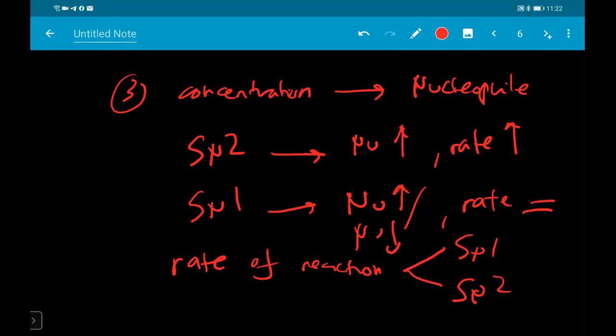Okay, all of this I highlighted, all the things that you need to include in your discussion. To explain the observation, macam tadi, kalau polarity, kena tahu protic apa, aprotic apa, siapa yang akan dipengaruhi. Macam for concentration ni, you should know which reaction is affected by the nucleophile. I already said that it is SN2.